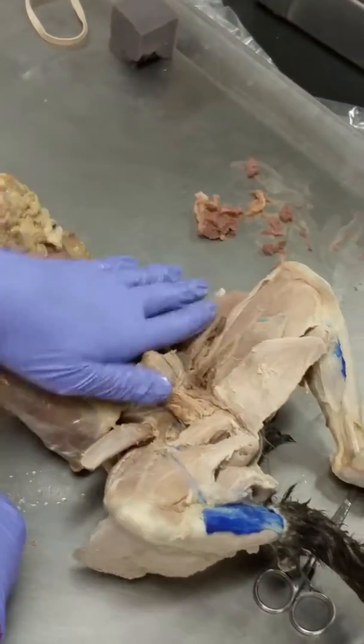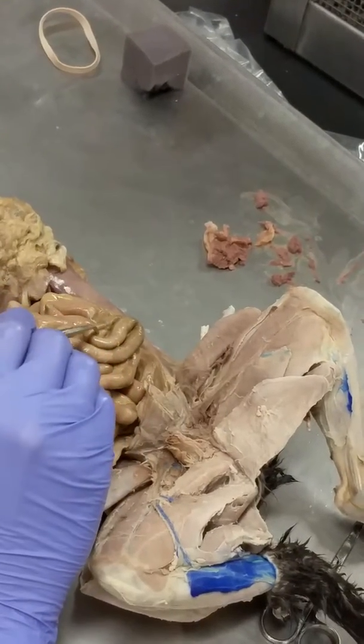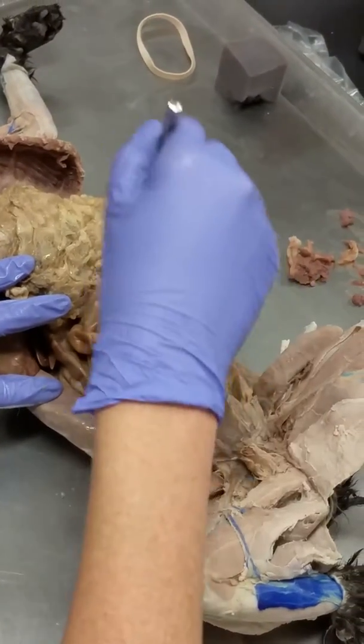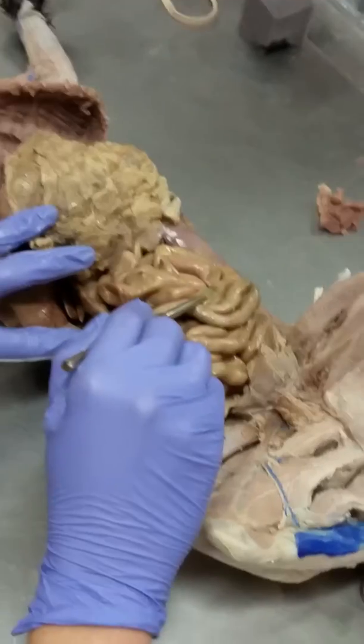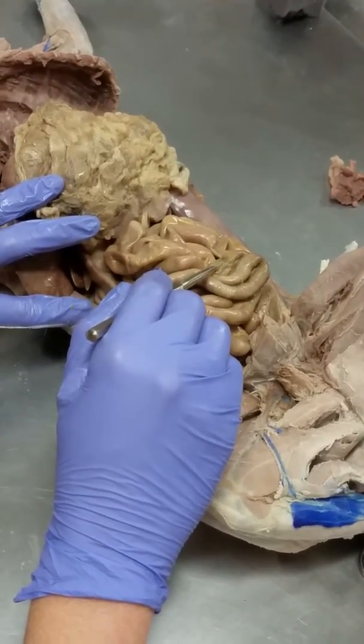If I pin jejunum, I'm just going to have the gut sitting there, and I'm going to pin somewhere randomly in the middle, where everything you see after is small and everything you see before it is small. So you'll just see small intestine if I'm pinning jejunum. Make sense? Sound okay?